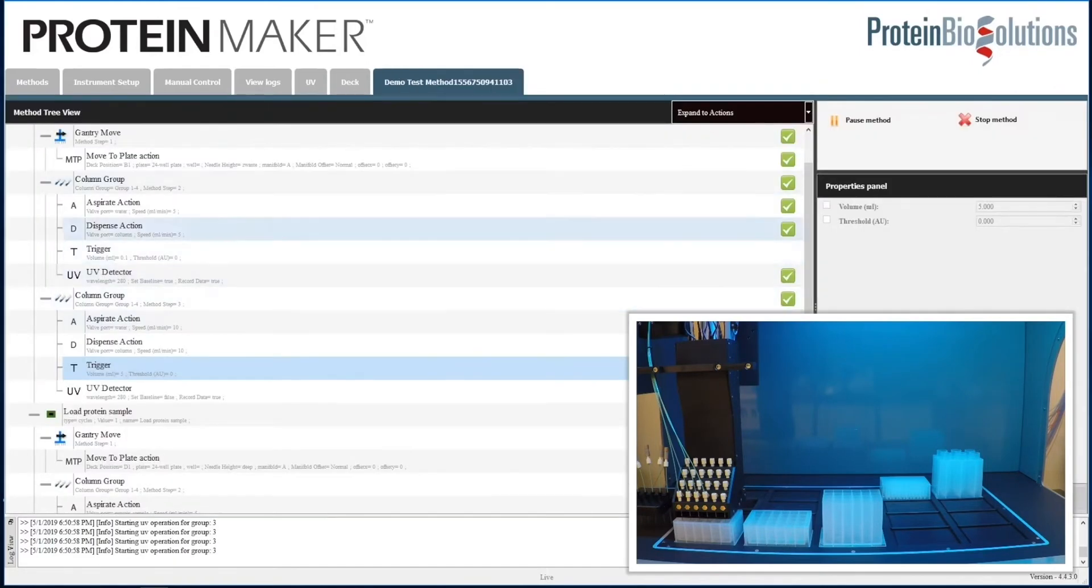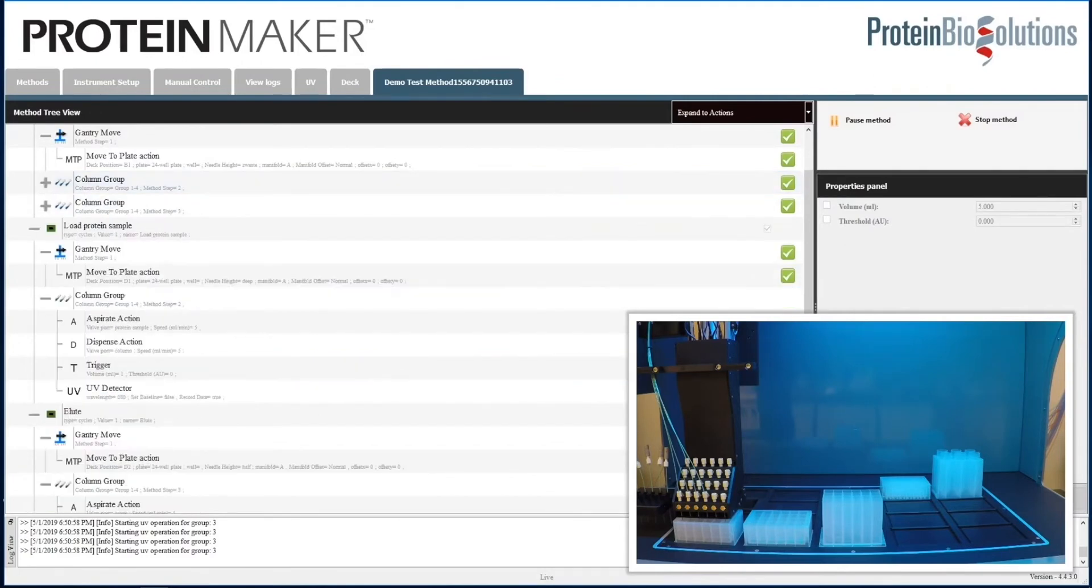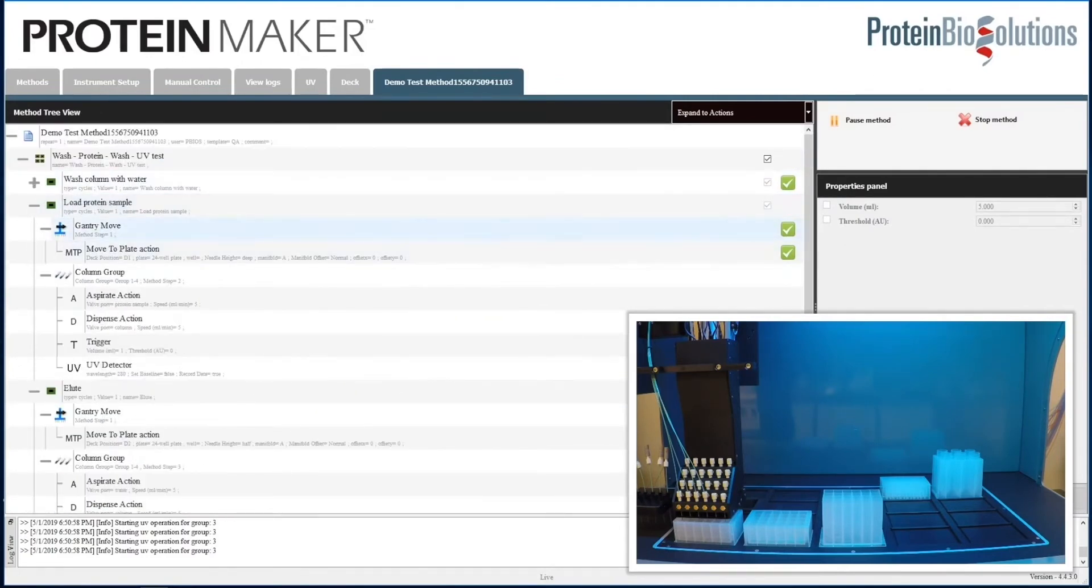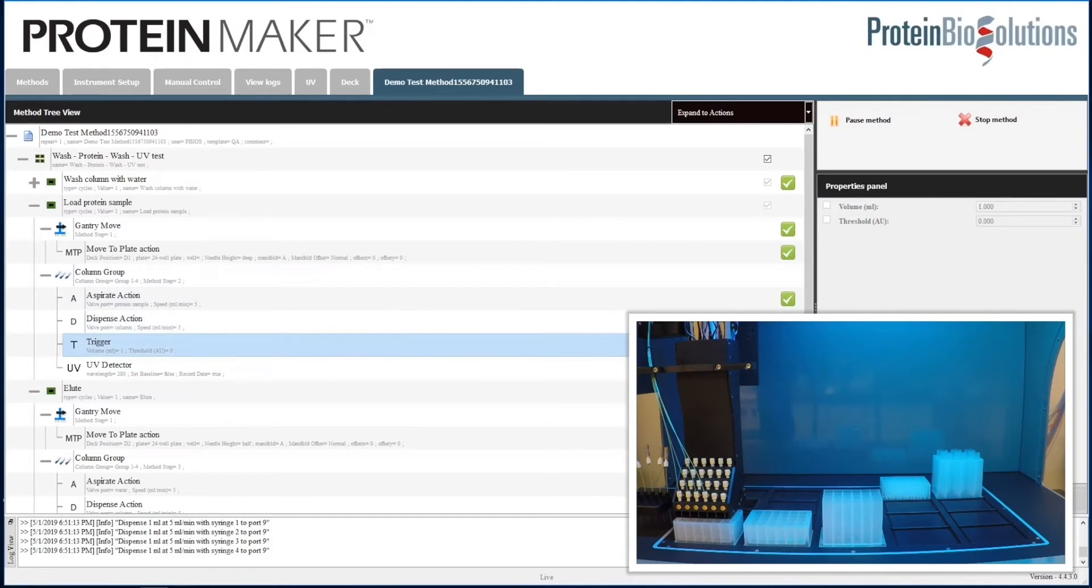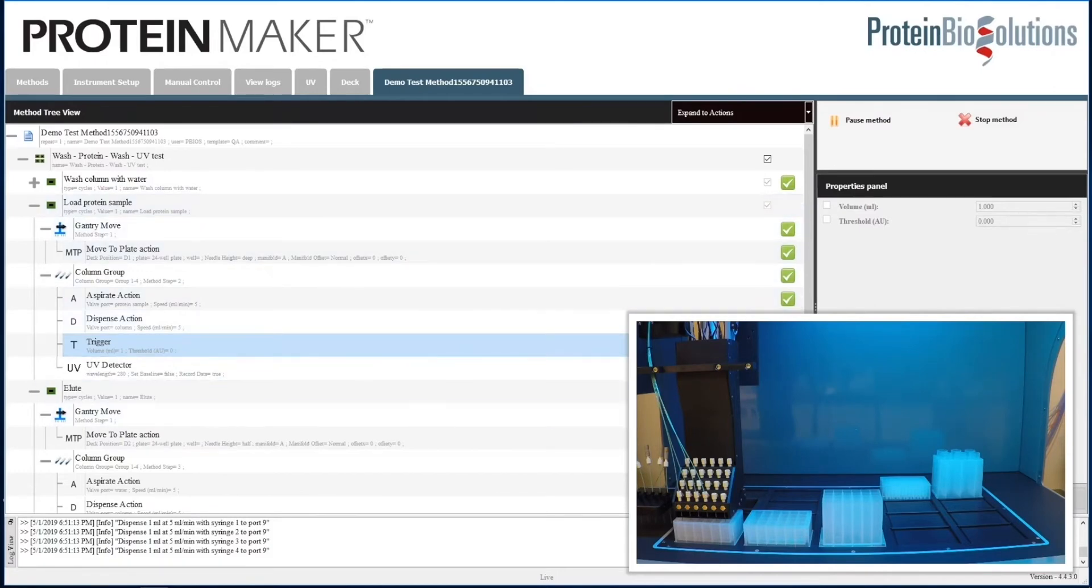Here we are loading one milliliter of protein, collecting the flow through in that plate. Back into the method view, you see the load protein sample submethod step. The gantry has moved to this position D1, the front left position. We have asked it to load from the protein sample port, port 4 as we saw in the column channel group. It will dispense to the column for a volume of one milliliter.